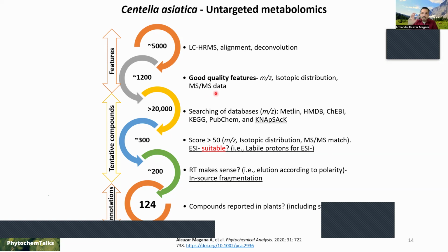And that we inject a QC, that is a pool of all our samples, and only ions that behave the same, because it's the same sample. So every time you inject it, you should see the same. So whatever is higher CV than 25%, we usually don't use those.